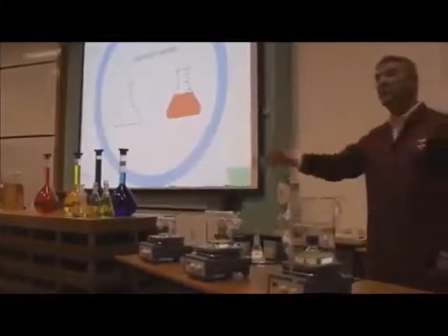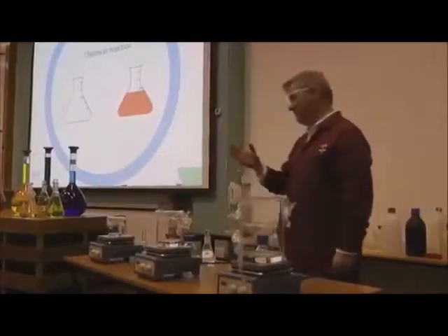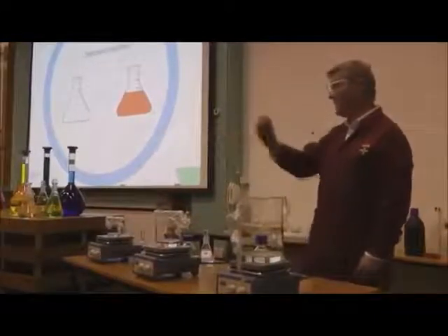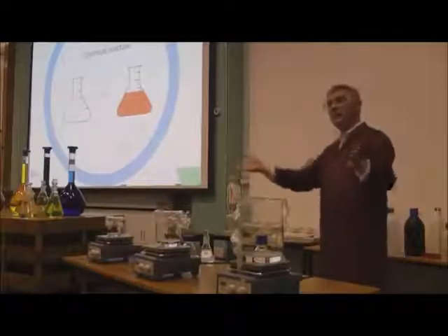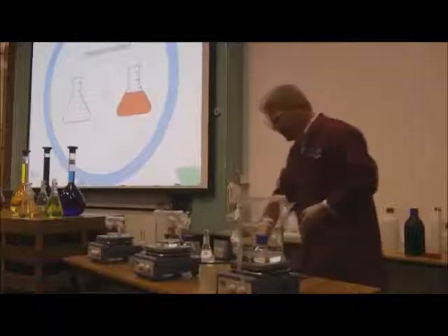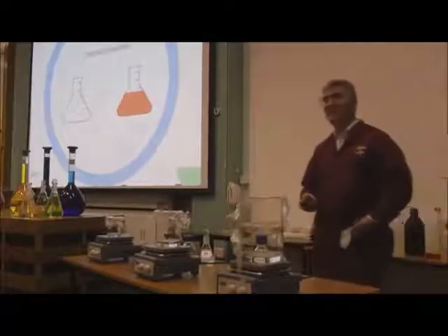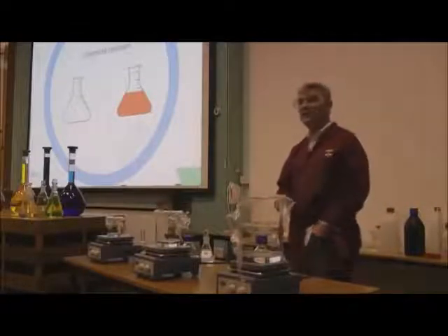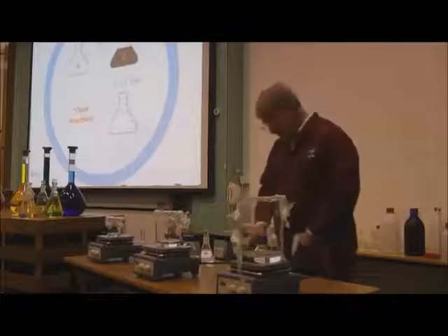In an ideal world, we would have gone water, wine, clear. But we didn't. But the quite interesting thing is the second one, where when they added them together, it didn't immediately change colour. It took a bit of time. So that's an area that I want to play around with, because I think it's quite enjoyable. To, one, you get colour change to show what's happening, and two, you get quite interesting things happening.